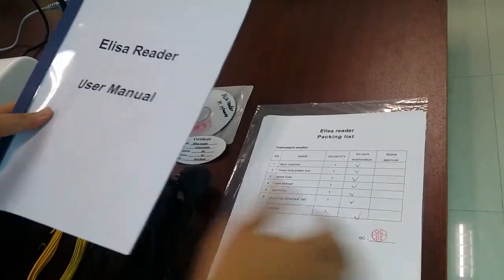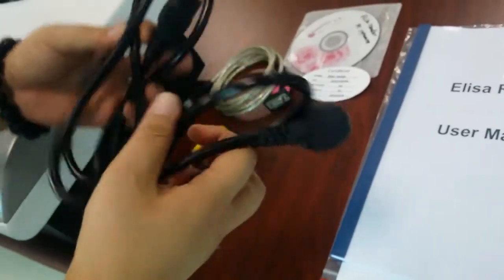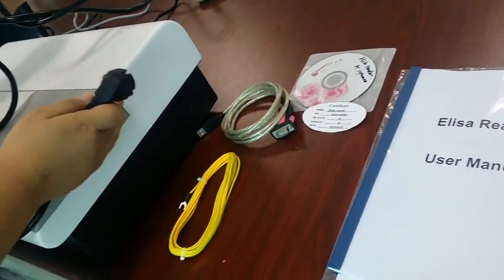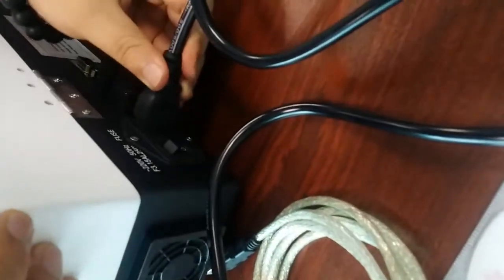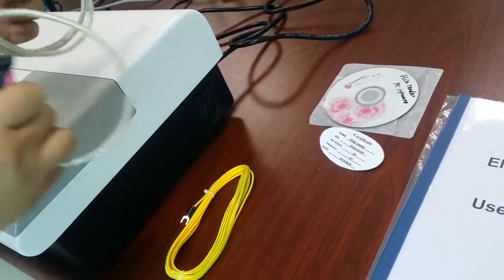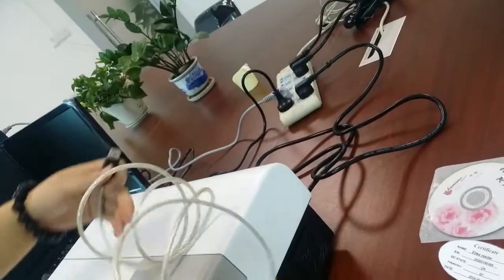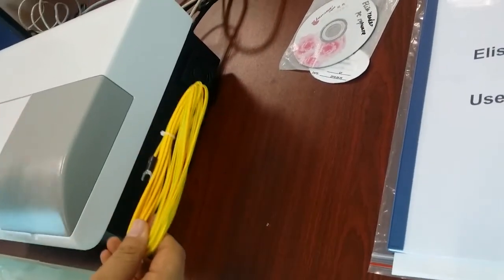We sincerely hope you could read them carefully. Now let me introduce how to install these cables. This cable is for the machine and the power. This cable is for the machine and the external computer — this side connects to the machine and this side connects to the computer. This cable connects the machine to the ground.